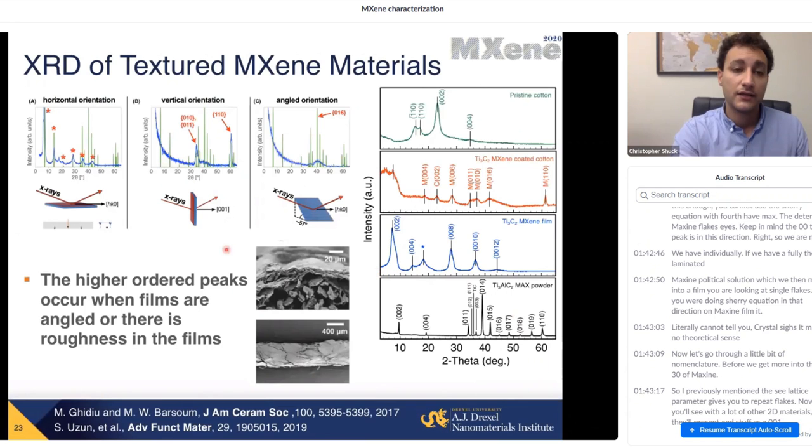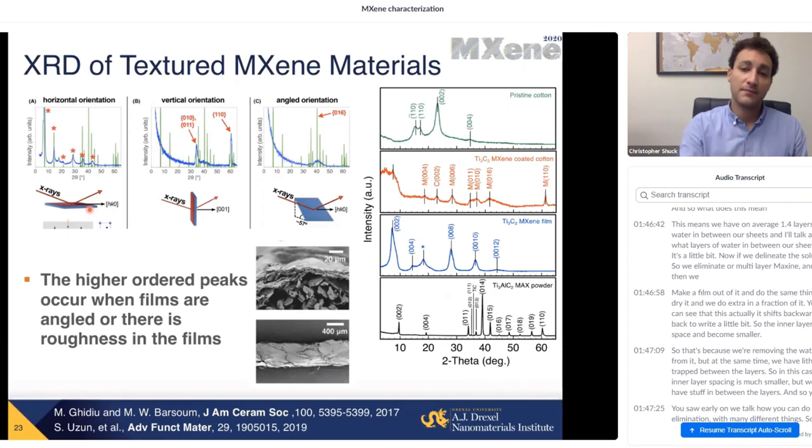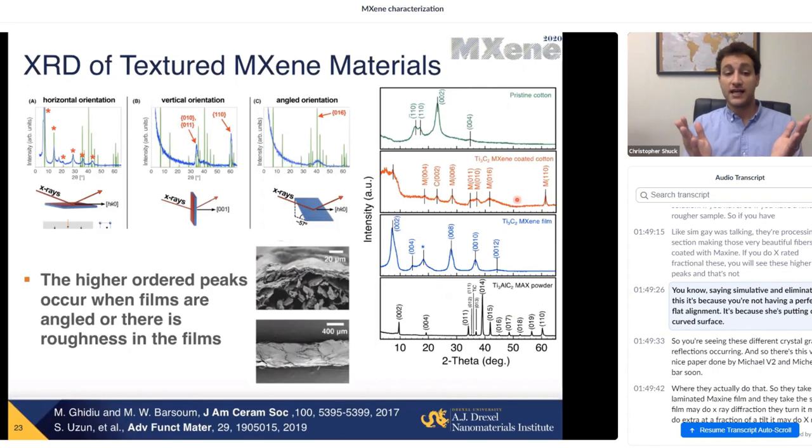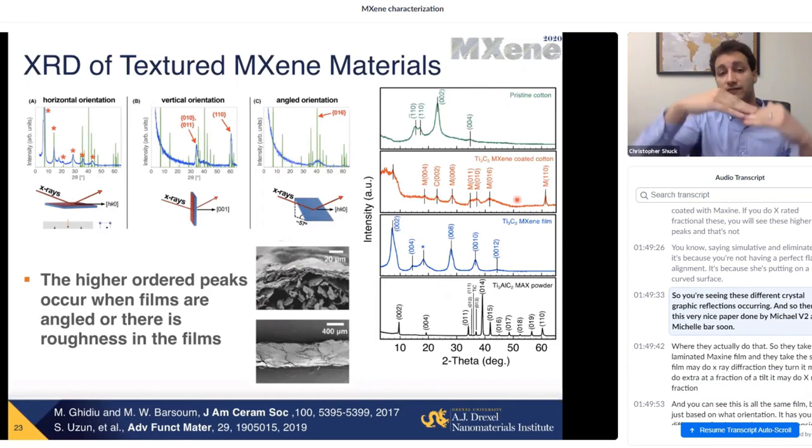Seeing the higher ordered peaks does not mean you do not have a delaminated solution. If you have a kind of a rougher sample, like Simge was talking about during the processing section, making those very beautiful fibers coated with MXene, if you do X-ray diffraction on these, you will see these higher ordered peaks. And that's not saying Simge didn't delaminate this, it's because you're not having a perfect flat alignment. It's because she's putting it on a curved surface. So you're seeing these different crystallographic reflections occurring.